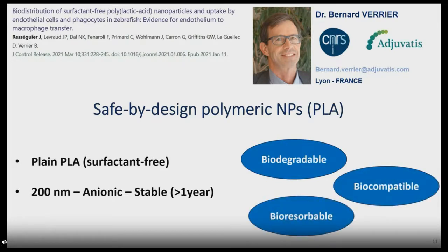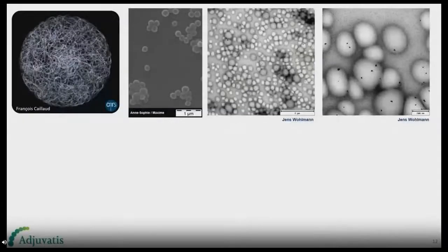And if we were to look at those nanoparticles, what do they look like? Basically, those particles are made of interlacing polymer chains, as you can see in these artistic visions. But if we look by electron microscopy, here in scanning electron microscopy and in those two images with negative stain by transmission electron microscopy, they just look like some very tiny ovoid beads.